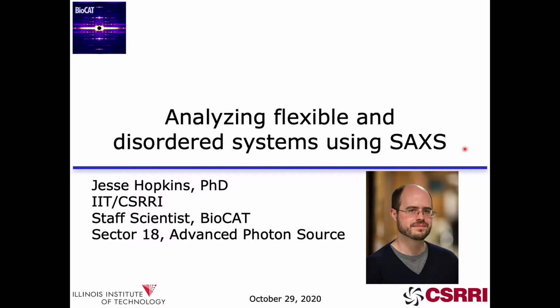So what I'm going to talk about today is analyzing flexible and disordered systems using small-angle X-ray scattering.